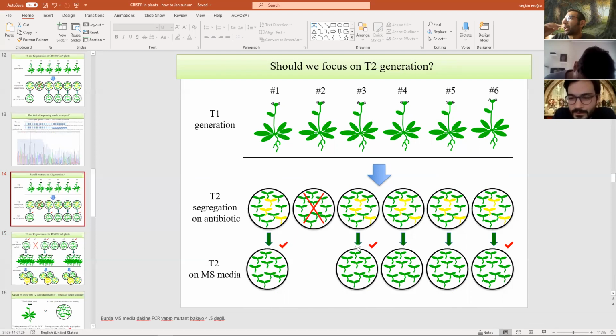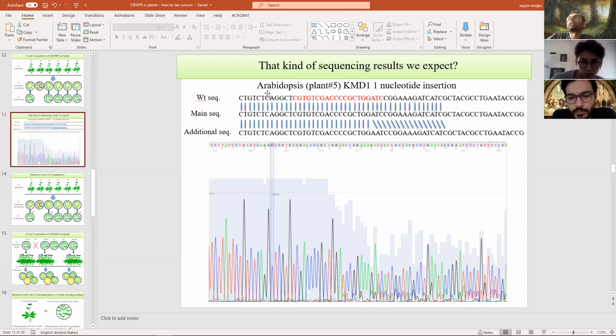Okay, so you see the guy made a tick on 3 of the petri dishes, but not 2 of them. The reason for this is he did PCR and looked for the mutation, and then he saw mutations in these and these and these ones, but not in those ones. And that's why he put that. Hocam, you did PCR, but so he did PCR and then he did sequencing. I see. He did sequencing.